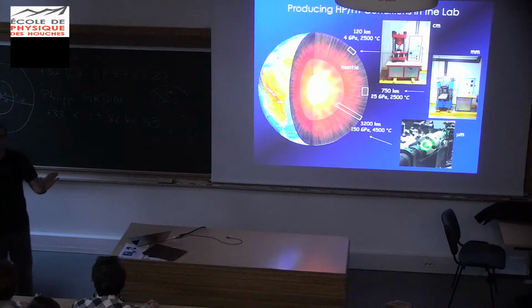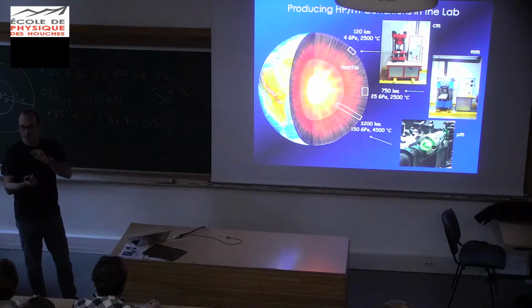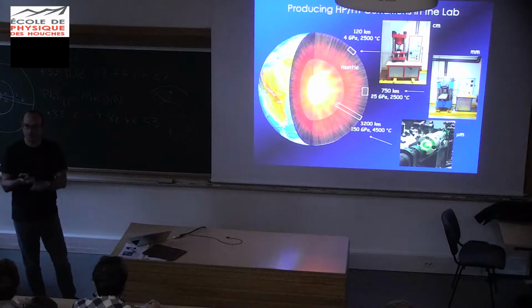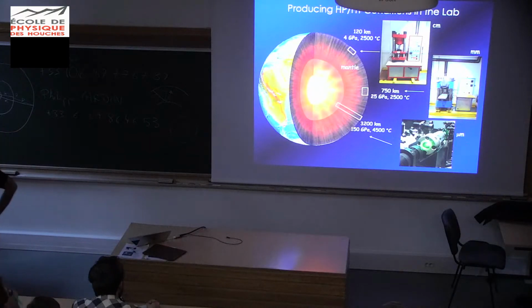You calibrate the pressure. Well, you measure the pressure on the ram. But you don't measure the pressure in situ in each run. You don't do it with the piston cylinder, and you don't do it with the multi-anvil. The only tool with which you do this is the diamond cell. And so you trust the fact that your machine is not aging.